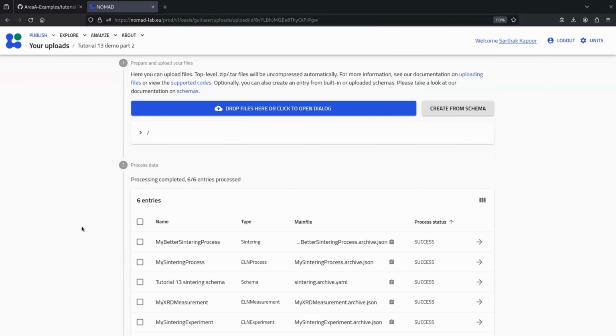Maybe you have an XRD. May I ask a question? Because I wanted to ask, when you are creating your schema and then you're uploading, for instance, an image as you did, how do you upload a file, like an HDF5 file or whatever, so that, as shown in the introductory slides, you are then able to also extract the metadata and display it and so on? But this maybe will come later, or right? This is right about now. So okay, thanks.